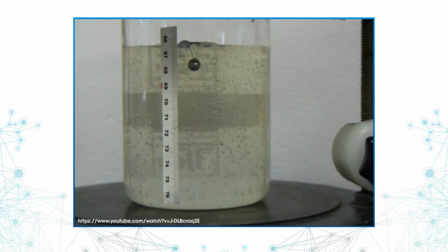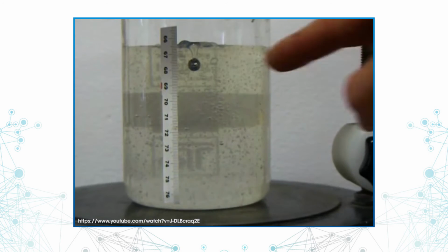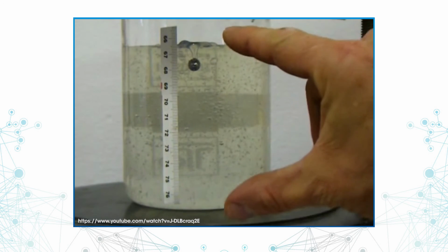Looking at the shear thinning, it's a material which has a certain viscosity and has a certain structure. And there is a 7 millimeter steel sphere which rests inside the gel-like material. The structure of the material is high enough to be able to support the sphere. And now we expose the system to dynamic load due to vibration at 20 Hertz and 1 millimeter.